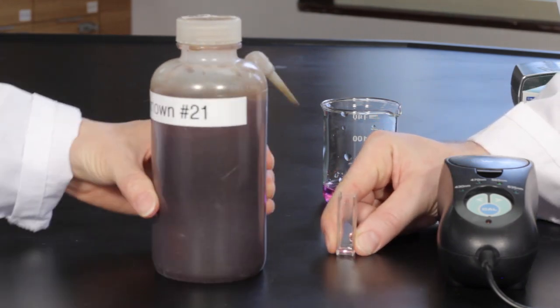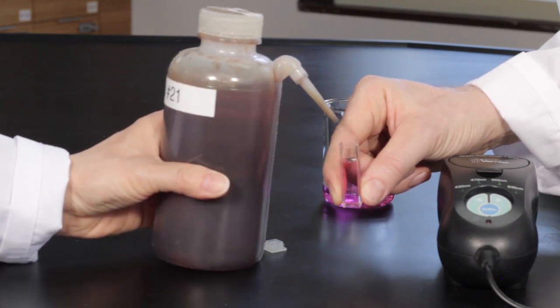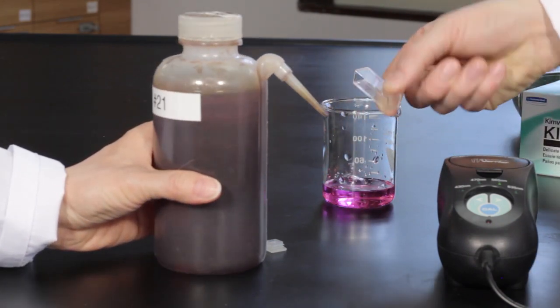Obtain an unknown solution of potassium permanganate. Rinse a cuvette with the unknown solution, then measure its absorbance and record it on your datasheet.